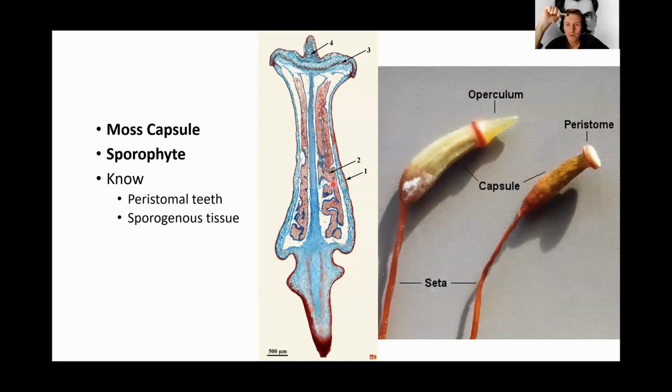And if you look closer, I'll show you a closer image of what the spore looks like, but these are all the spores. And there's millions of them, and they all fly into the air and they all colonize everything. But mosses are pretty bad at colonizing.